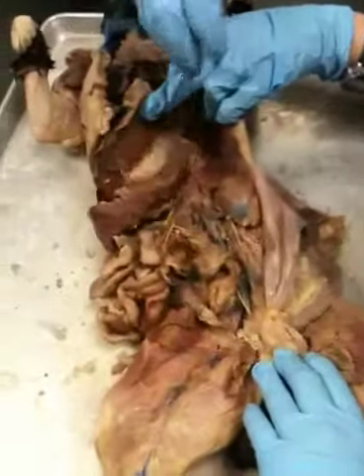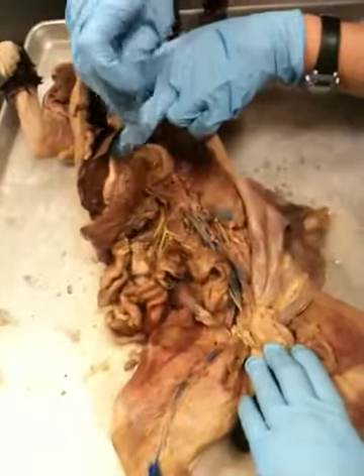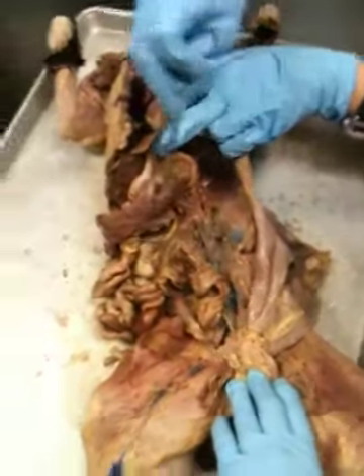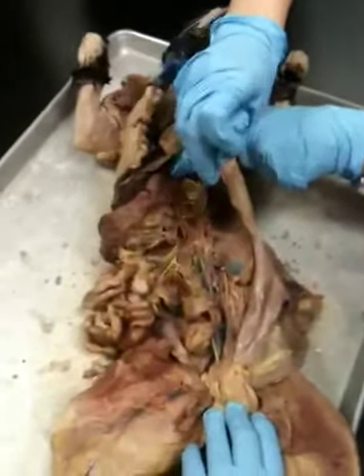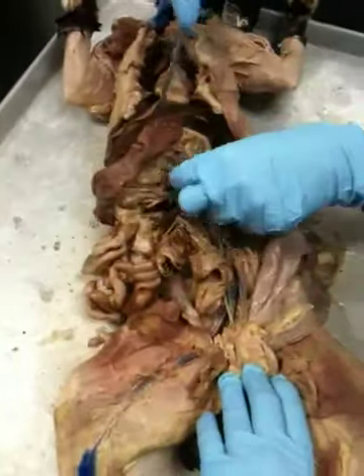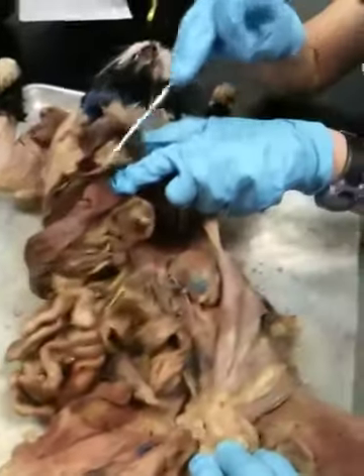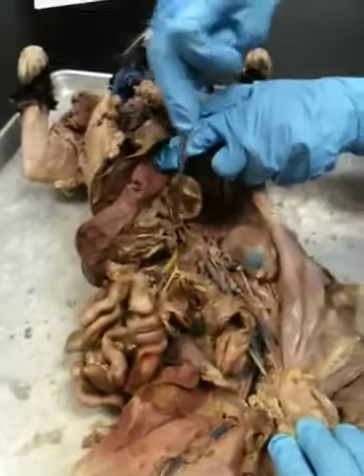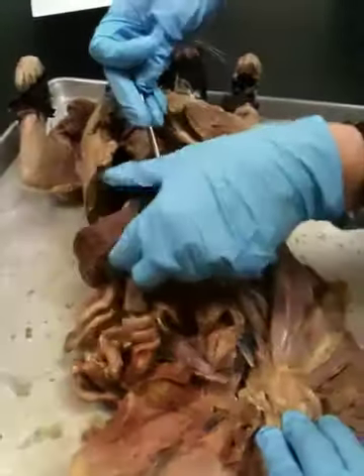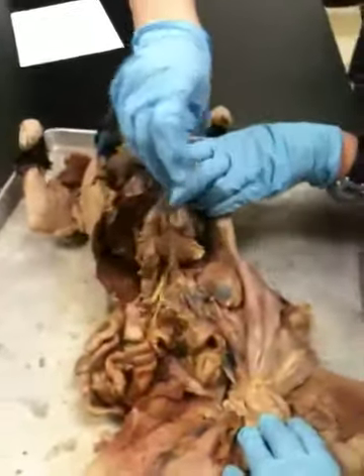All right, and then here we've got another big vessel that looks like it has a bunch of splits. You got one that's coming to this guy. That's the celiac. So this is your celiac, and this one coming over here is hepatic. That's splenic. And then this one, is that the superior? No, that's the gastric, because it's red.